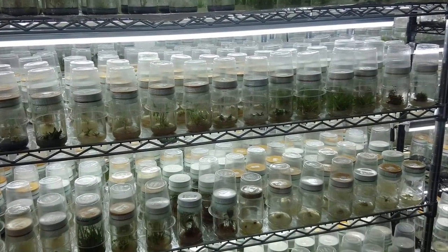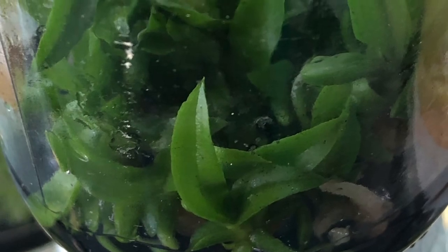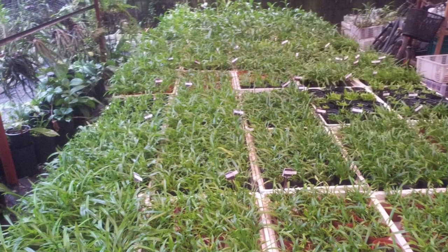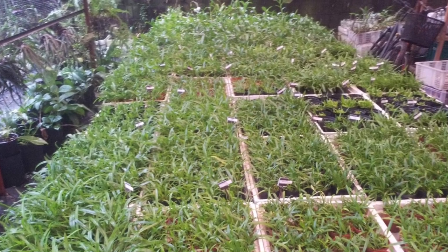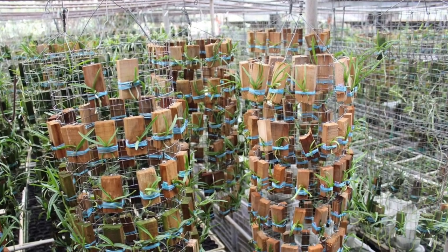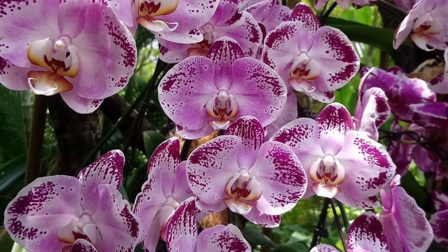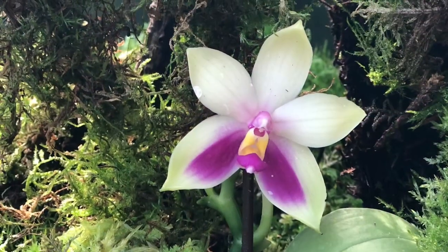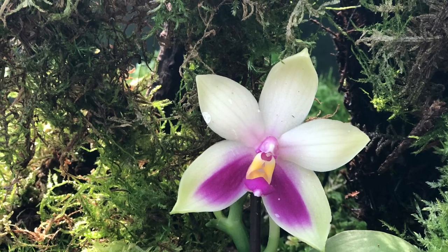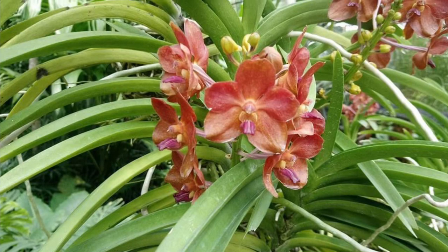The greenpad technique is very commonly done by commercial orchid growers. This technique involves scraping the immature seeds from the fruit of orchids. It is easy to do, but it involves scraping the placental mother tissue together with the seeds. If the mother plant is virus infected, there is a big chance that the seedlings may carry the virus.